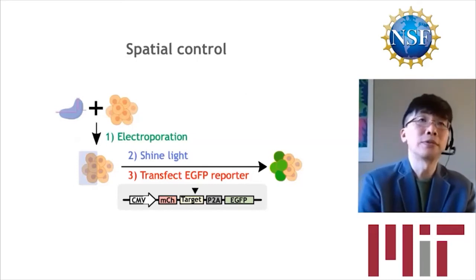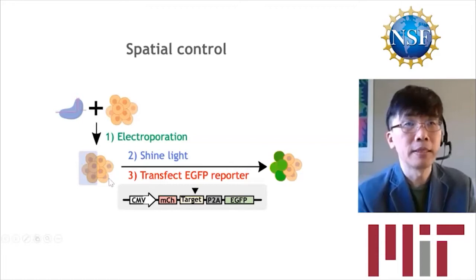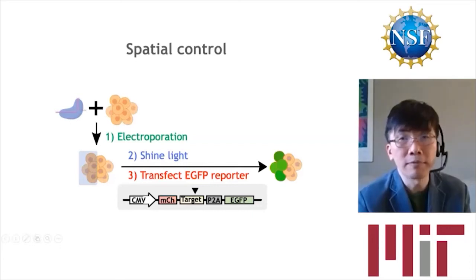We can also use light to achieve spatial control. Here we electroporate cleavable RNA and Cas9 into the cells, and then we shine light on only one half of the cells to inactivate Cas9. Then you can transfect the cells with the GFP reporter. Under normal conditions without light, Cas9 is active, so it'll cut the plasmid DNA using the target sequence, and there is no GFP expression or fluorescence. But if you shine light on half of the cells, these cells have no Cas9 activity, and therefore GFP gets expressed, and the cells become fluorescent.